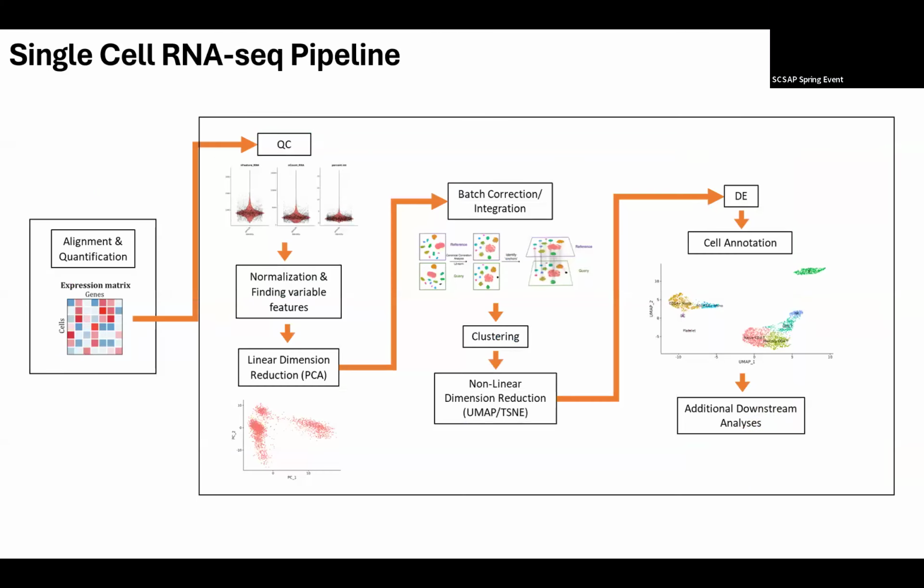So I'll give a little bit more detail about the type of analysis and techniques that we can provide at the core. The first one that we do is a lot of single cell RNA-seq data analysis. For this type of data analysis, we typically take your data, which can be represented as a data matrix of expression profiles, and we develop pipelines to go through quality control, trying to get rid of low quality cells and genes before we do any additional analysis. We also perform normalization of the data so that different cell sizes and different sequencing depths can be properly dealt with. Then dimension reduction and batch correction are the common techniques that we apply so that we ensure the data quality is high enough for any subsequent analysis.